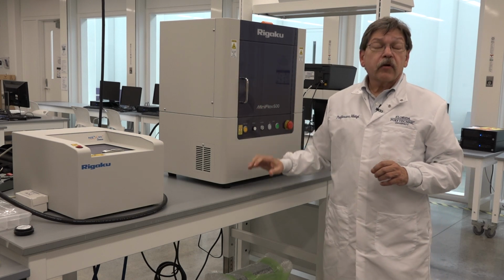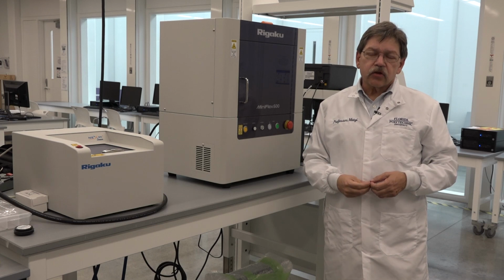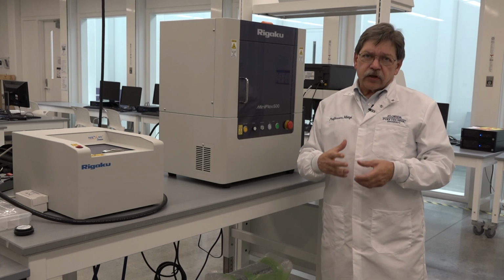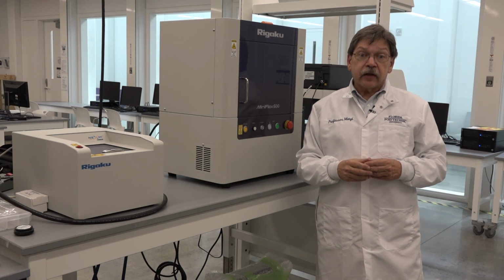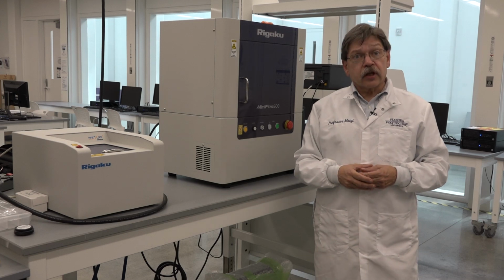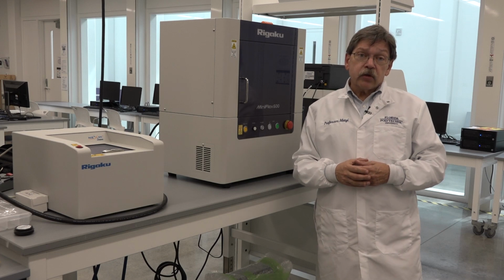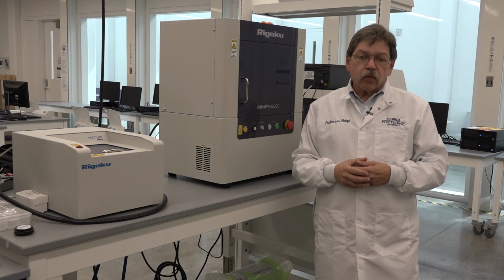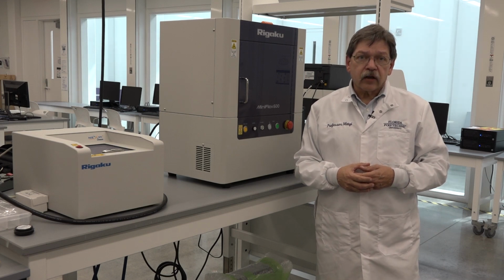It is also fully interfaced with the most recent Rigaku analytical software. All those changes, hardware and software, make this instrument a very fine research tool, in addition to the quality control applications we mentioned before. So this instrument is actually fairly heavily used now for routine research level X-ray powder diffraction analysis.